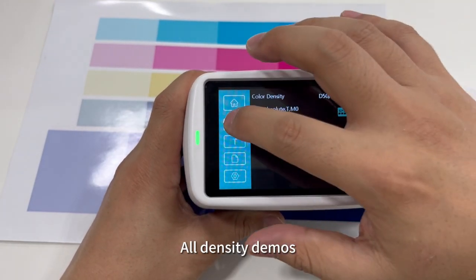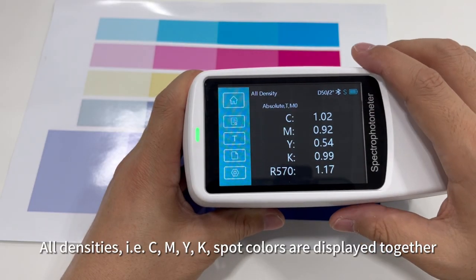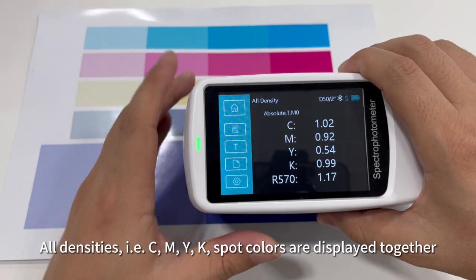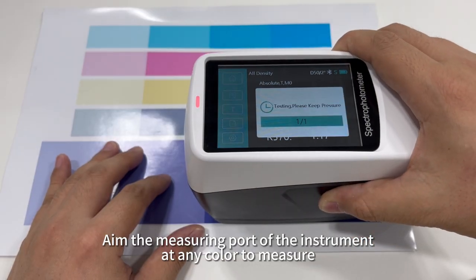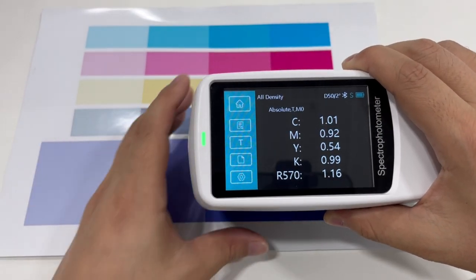All density demo. All densities, I, C, M, Y, K and spot colors are displayed together. Align the measuring port of the instrument. Add any color to measure.